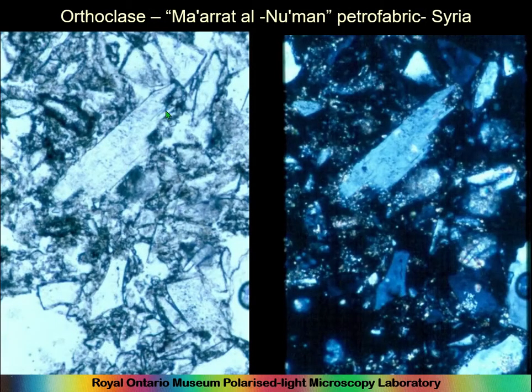The cleavages, this is actually a piece of pottery now. This is the stone paste fabric, the medieval, shall we say, an artificial paste, although most of the constituents are in fact natural. So this is mostly made of crushed quartz. And there's a bit of glass. This is actually a fragment of the glass inclusion here. And there will also be clay.